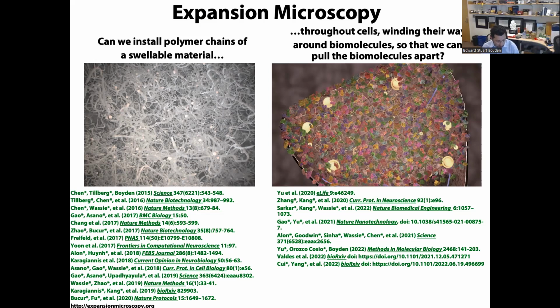And so we set out to try to develop a real strategy that would allow anybody to do nanoimaging, and hopefully to democratize nanoimaging. The basic concept is we take a specimen and we synthesize a swellable polymer throughout it.